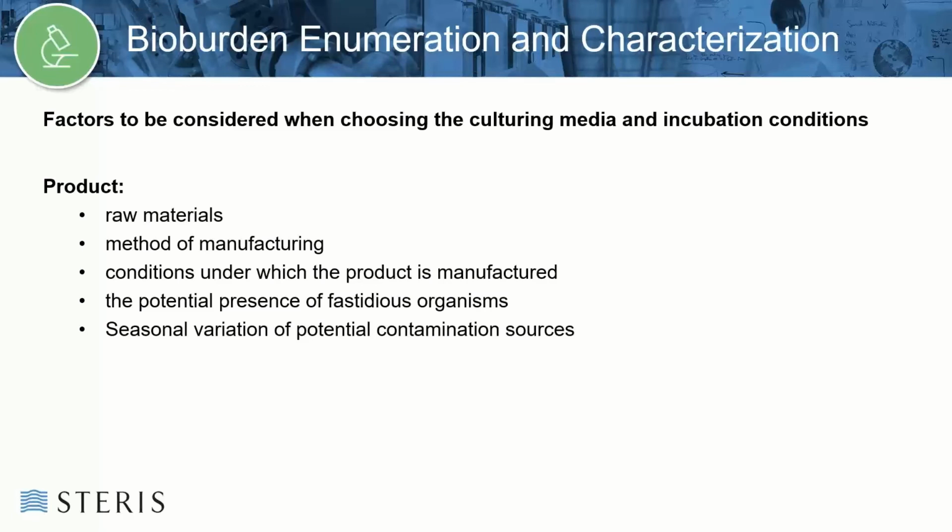As there's no single combination of media and incubation conditions that can support growth of all microorganisms, a general purpose non-selective culture media and incubation conditions can be used unless fastidious microorganisms are suspected to be present on the product. A rationale for consideration of the organism being tested should be documented within the manufacturer's quality system. Consideration should be given to the conditions selected to minimize the potential to overestimate the average bioburden due to counting of the same organism on different media.